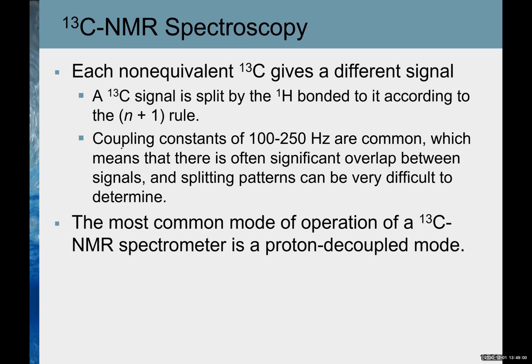So all the topics needed for proton NMR were discussed so far. Do you guys have any questions? The main things to remember in proton NMR are, first of all, the chemical shift values, where the chemical shift is expected. Is it upfield, is it downfield?